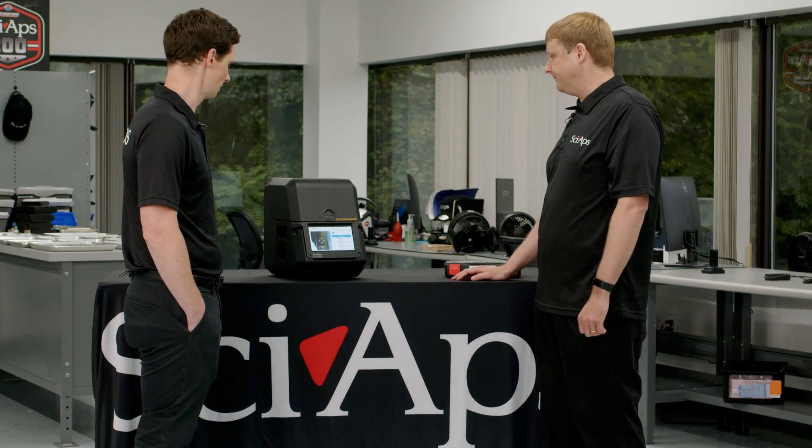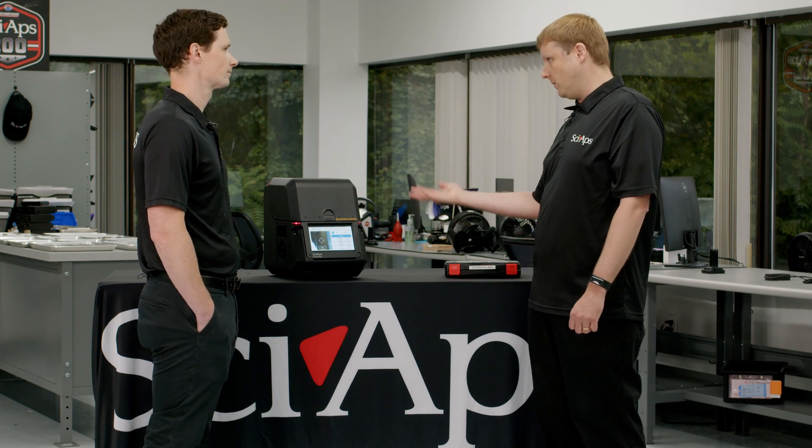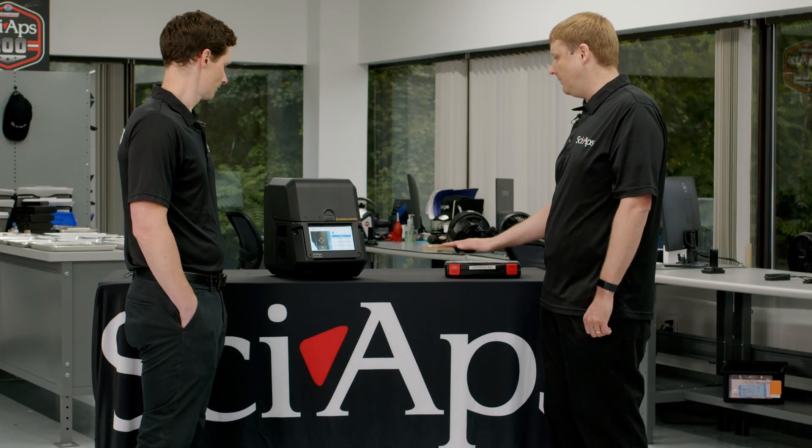We're running off of batteries right now, actually. It has an integrated fan just for cooling so you can use it out in the field to keep it at a reasonable temperature.